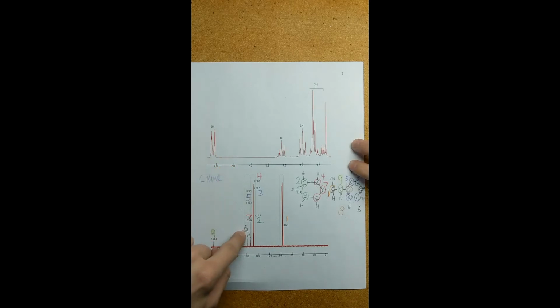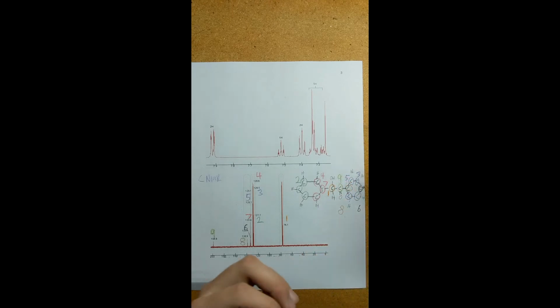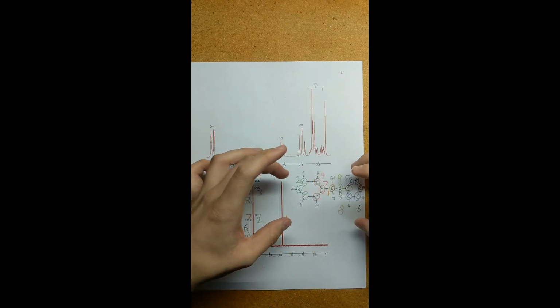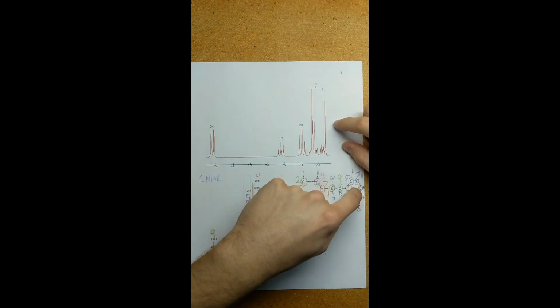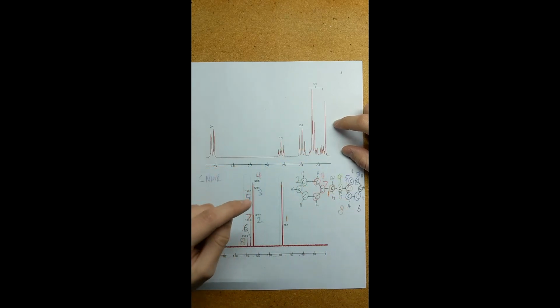Moving on to number 6, our 133.4, even slightly more deshielded. I chose this outside carbon here. You may be wondering why, considering in this example it looks to be farther away than, say, these carbons. But in terms of how this would sit as a 3-dimensional structure, it would not be linear like this, and that would actually be more susceptible to being affected by an electronegative oxygen.